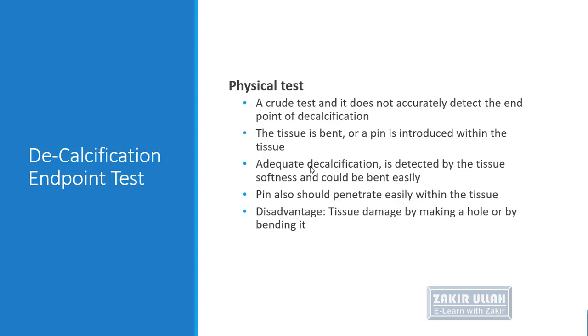One disadvantage of the physical test is that tissue damage may occur because of hole formation when we introduce a pin into the bone, or when it is bent it may distort, and the structures of the cells may be distorted. These are the disadvantages of physical tests.